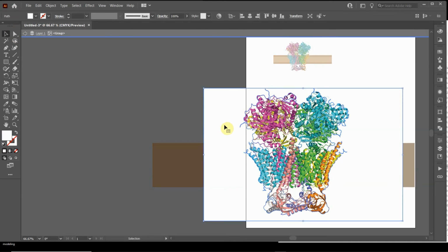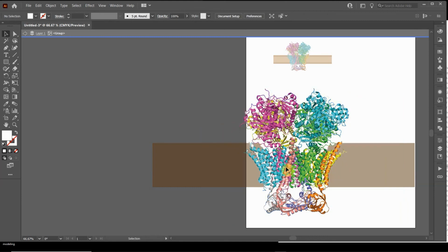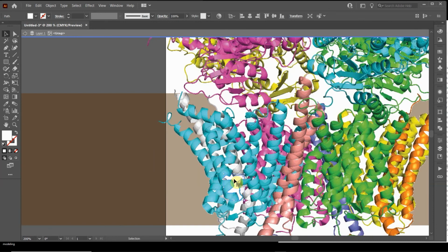And now I can click on it and delete, but I'd have to go through here and delete each and every one. And it's quite a tedious job to do, but it will achieve the same results as the low color, but it would be a little better because you would notice that the resolution of the coloring is much higher. So this would be if you're trying to draw a larger image and you just absolutely wanted it to be very precise. But notice that this is quite tedious, but it's not as bad as you would think.